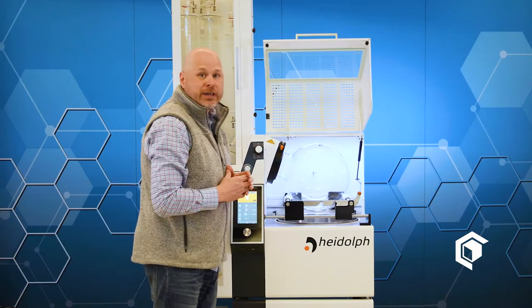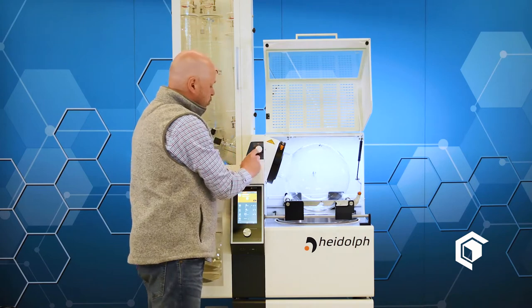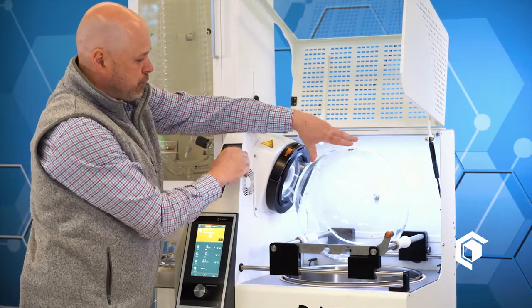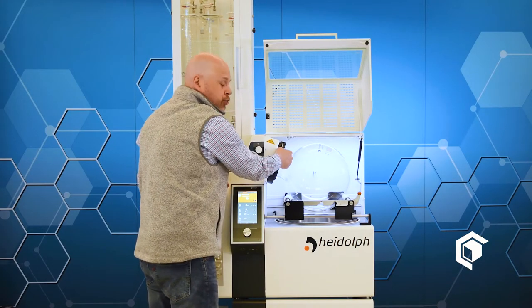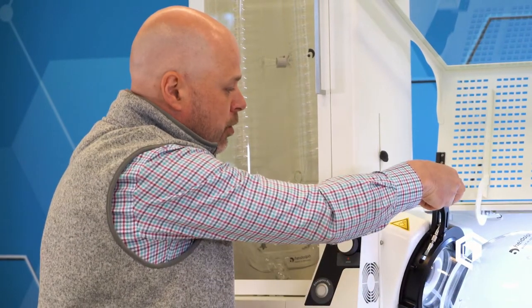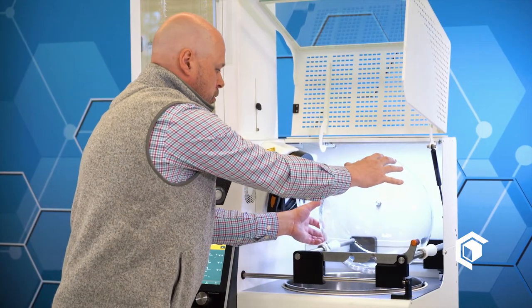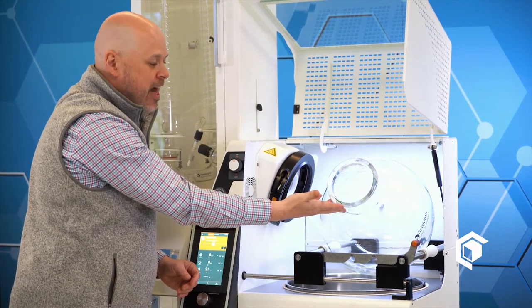Let me show you how easy it is to take off the flask. The first thing you want to do is use the lock knob — just rotate it. You can feel it lock, you can see it lock. And then you have this trigger or button that will release the evaporation flask. All you do is bring it down and pull out the evaporation flask. It's that easy.